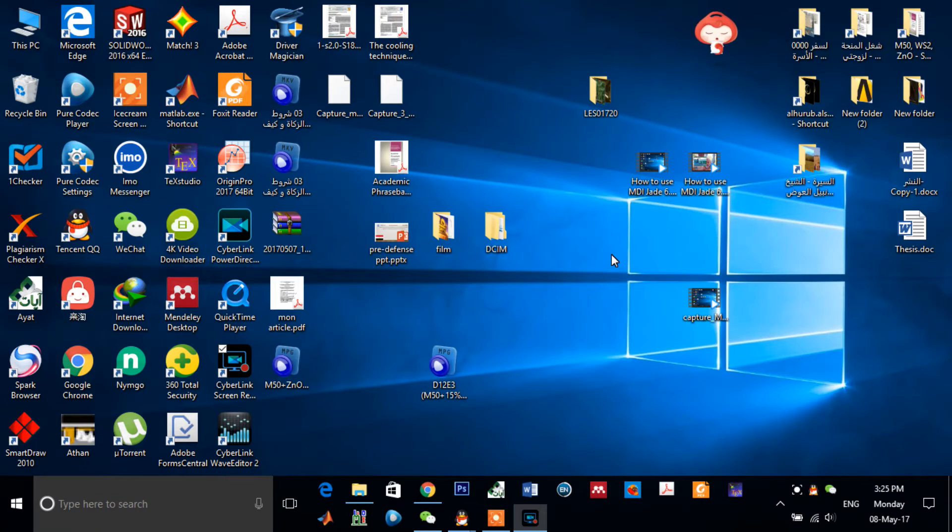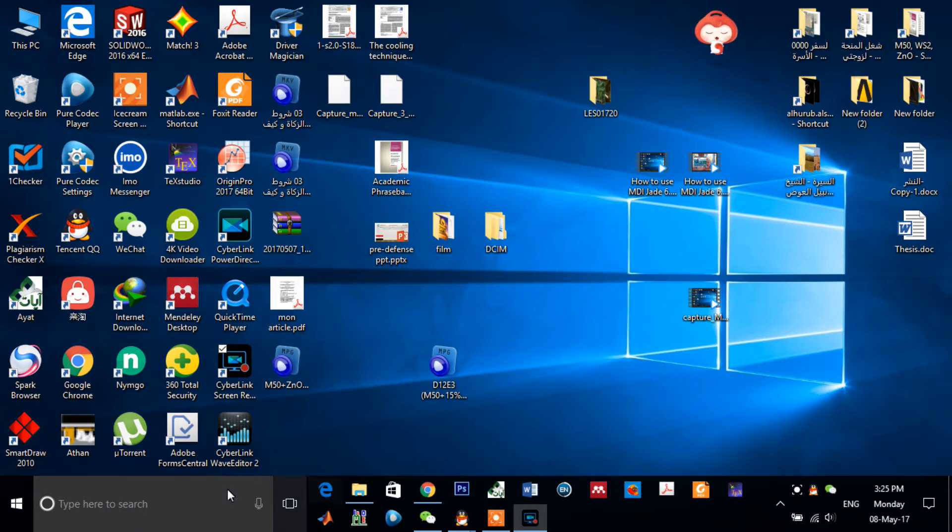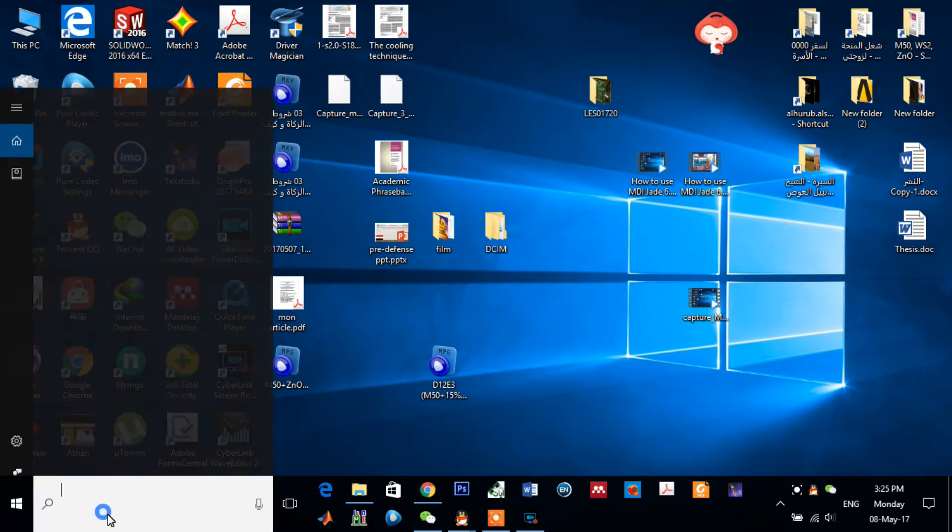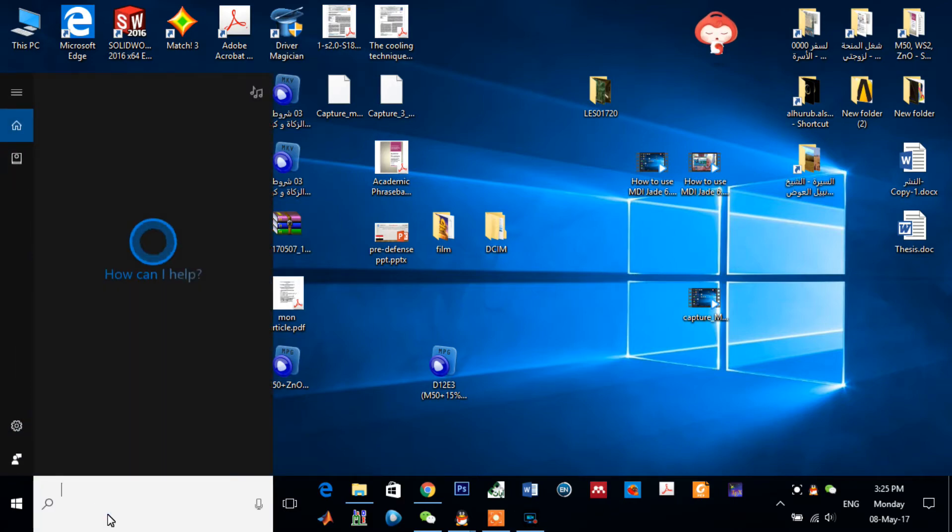Assalamualaikum warahmatullahi wabarakatuh. Here's today Fadlaysa tries to explain how to use MDIJD version 6.5. Let's open the software.